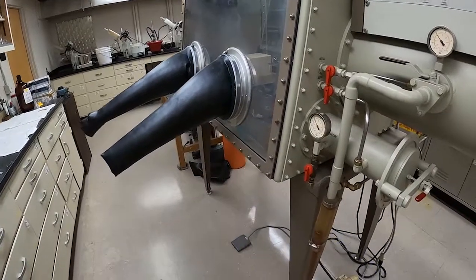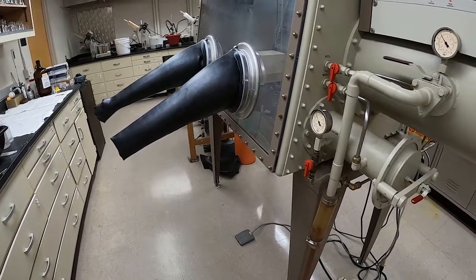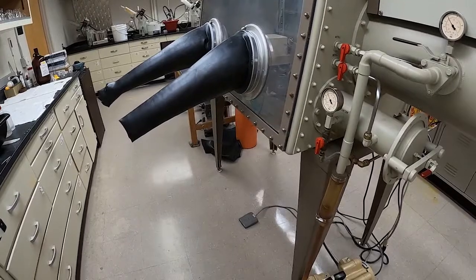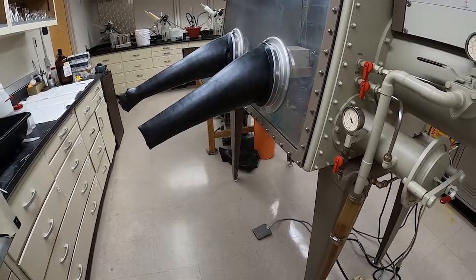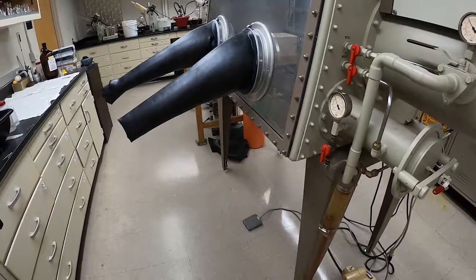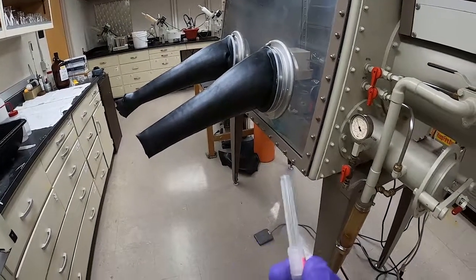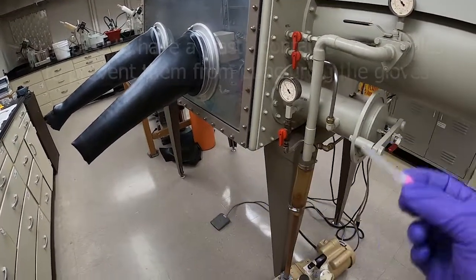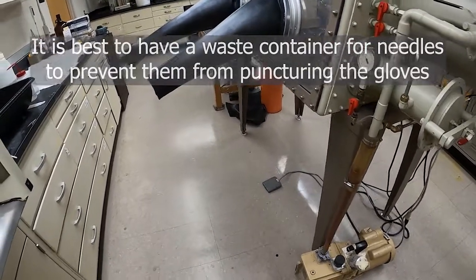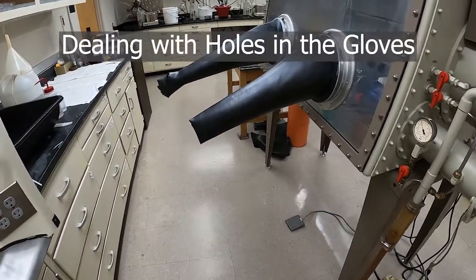One of the single biggest hazards to the gloves of a glovebox are needles. Avoid using a needle in the glovebox if you can. If you do need to use one, you can put them into a septum to bring them out of the glovebox. If a needle has been punctured through a septum, don't push it all the way through — that's just asking for someone to grab the septum and puncture the glove. Never recap needles; that's a general rule outside the glovebox too. If you are done using a needle in the glovebox, have a waste container or tray specifically for needles, and bring them out as soon as possible so they don't present any risk to the gloves.